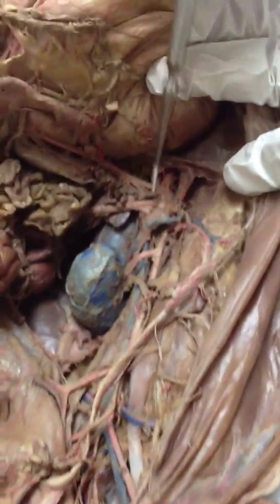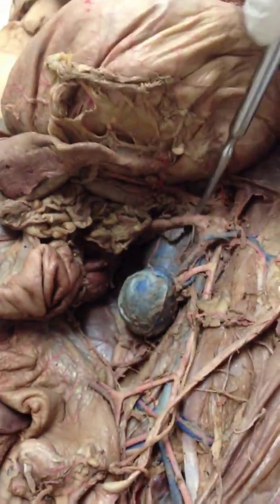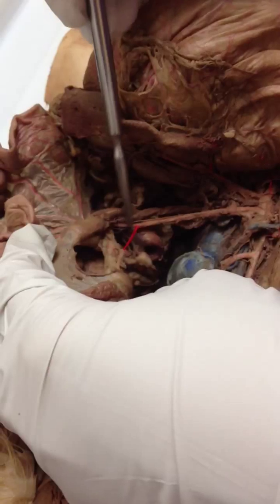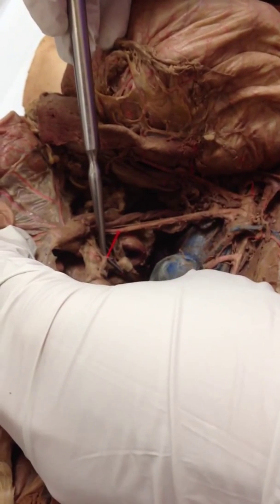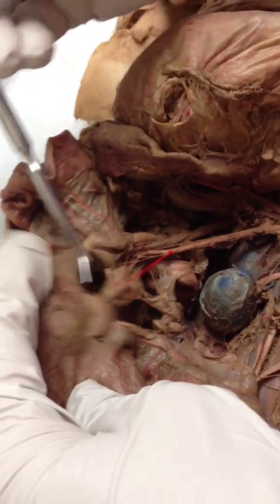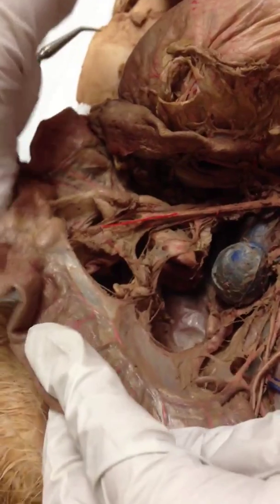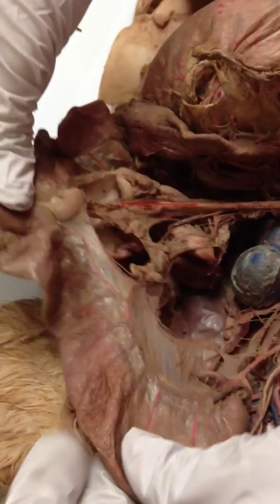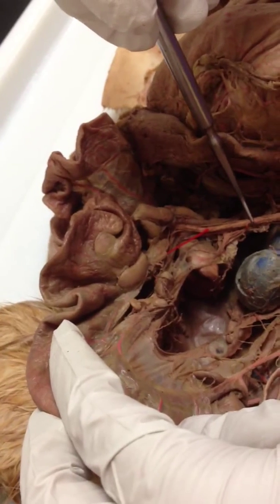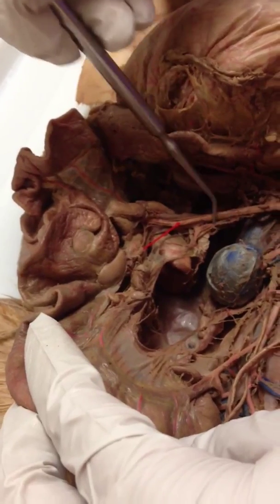Then we have the cranial mesenteric artery, which is the second branch from the abdominal aorta. We have the ileocolic going to the part of the intestine, so it would be this one. This is the ileocolic. You can just see where it goes to the ileum and the colon. Right up here should be the middle colic, which would probably be this one, but it's broken.